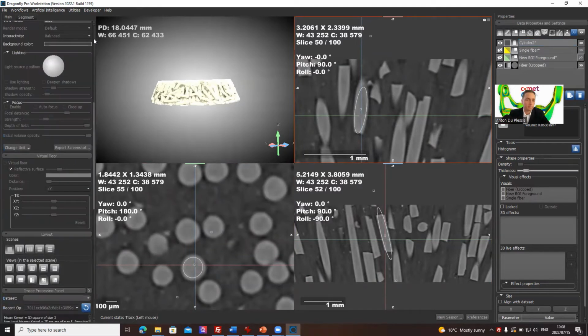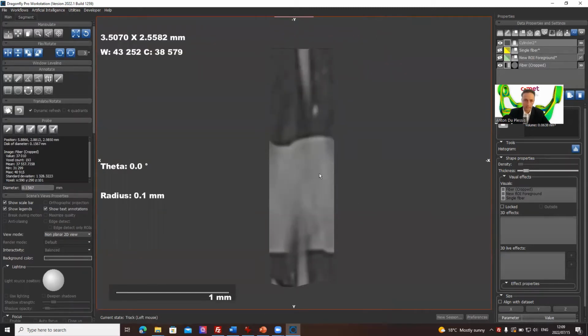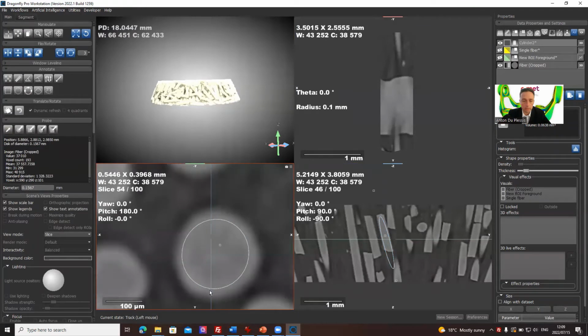So we've got a cylinder now, and what we can do is go to the main tab, under scene view properties, and show a non-planar view. So this is now unrolling around the perimeter of the cylinder. This is a way of visualizing some cylindrical feature, unwrapped like a soup can wrapper, which is flattened out. The same thing can be done with a sphere, and we can also change that location and geometry or diameter.